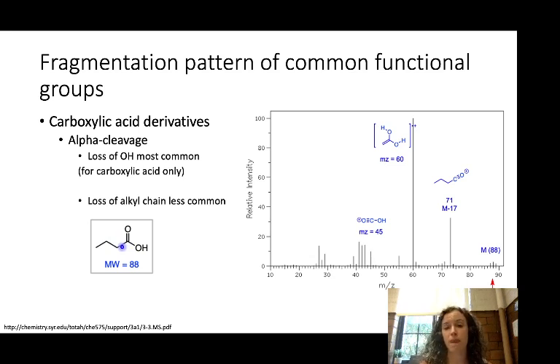And so something that we might expect to see in class is shown here. Let's say we're looking at a product that has a molecular weight of 88. Let's look at some peaks. Well, here on the spectrum, there's going to be a smaller parent ion. In many of the mass spectra that we will look at, it'll be a little bit bigger than this. You can also see there's something with a mass of 71, right? Take the difference in mass and let that help you figure out what has been lost.